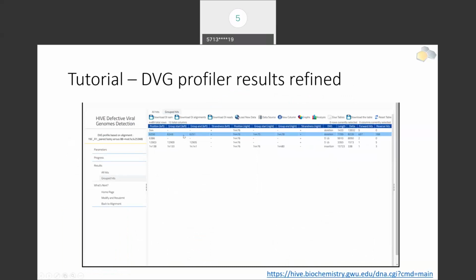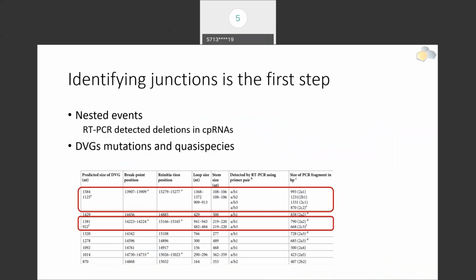And it also includes information about these groups, where the first one was reported and where the last one was reported. And here is just the position of the peak as reported. That also leads to a smaller, consolidated set of junctions.